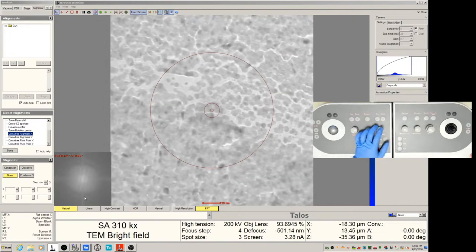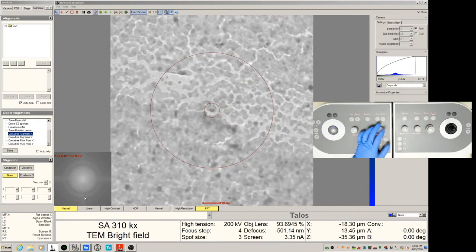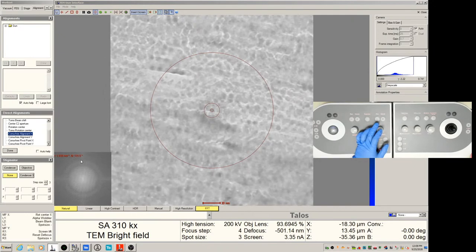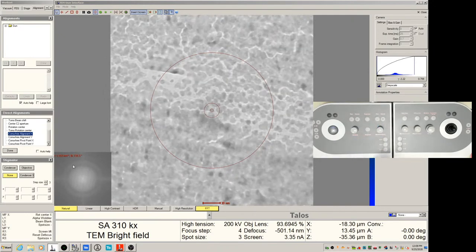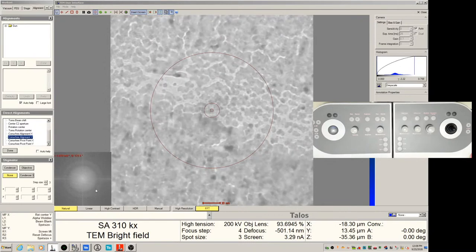So now let's move it back. So something like that. Now two sets are very identical. So this is the goal. And you can do the same thing for the Y. And you see the Y is already very good.